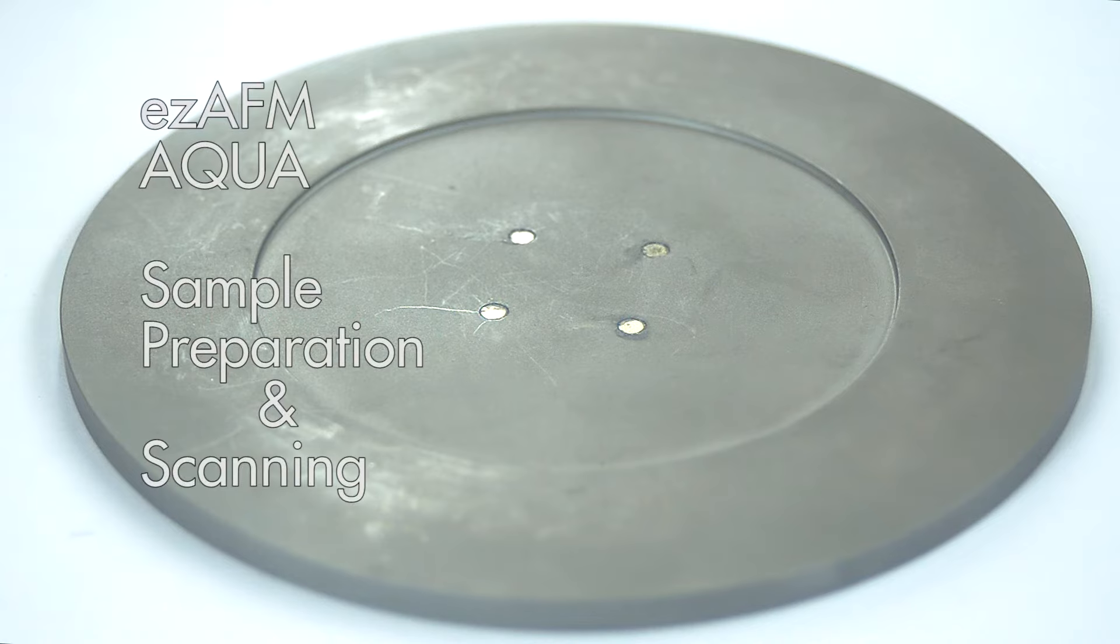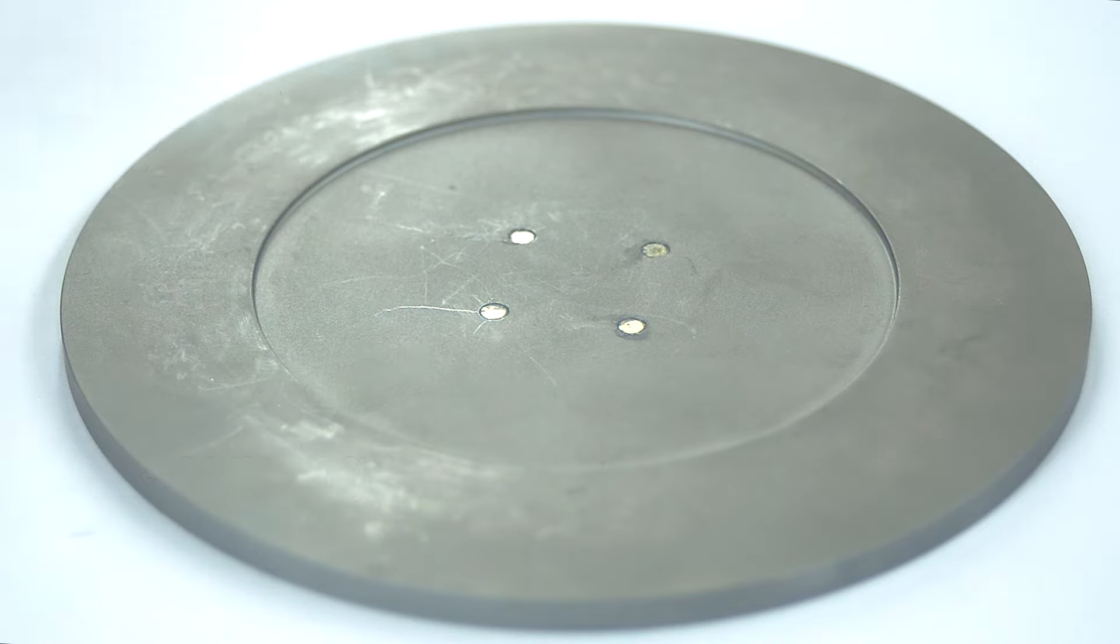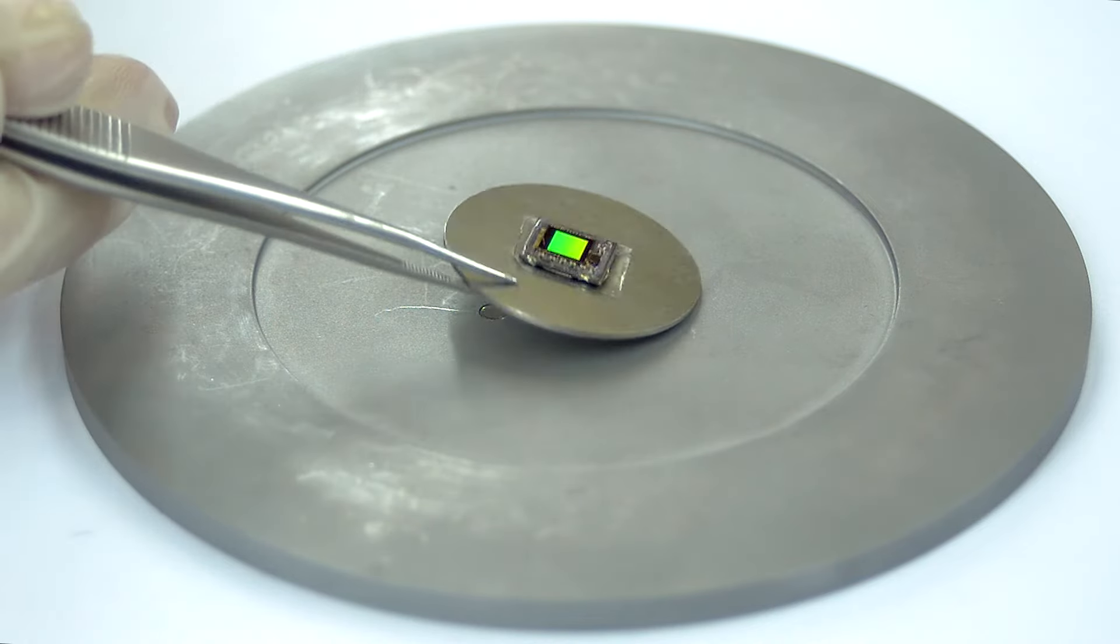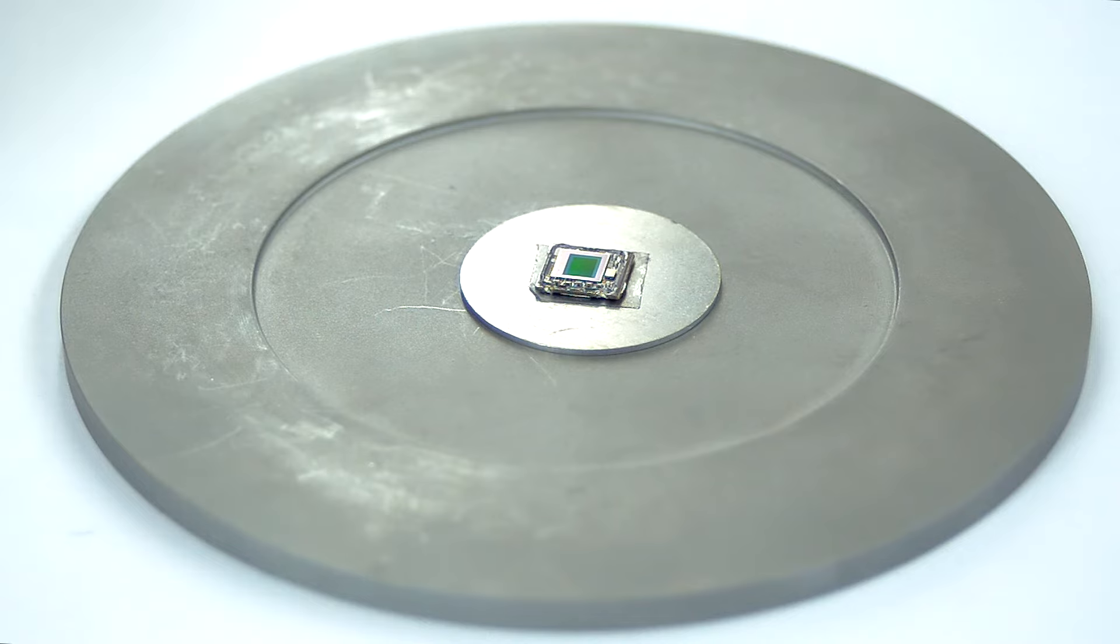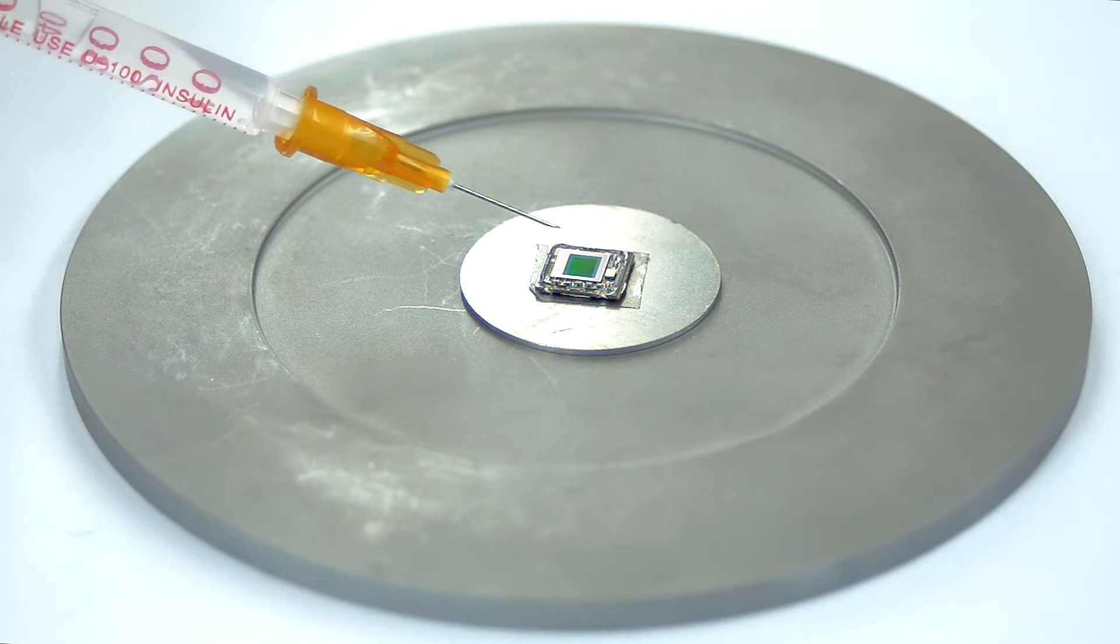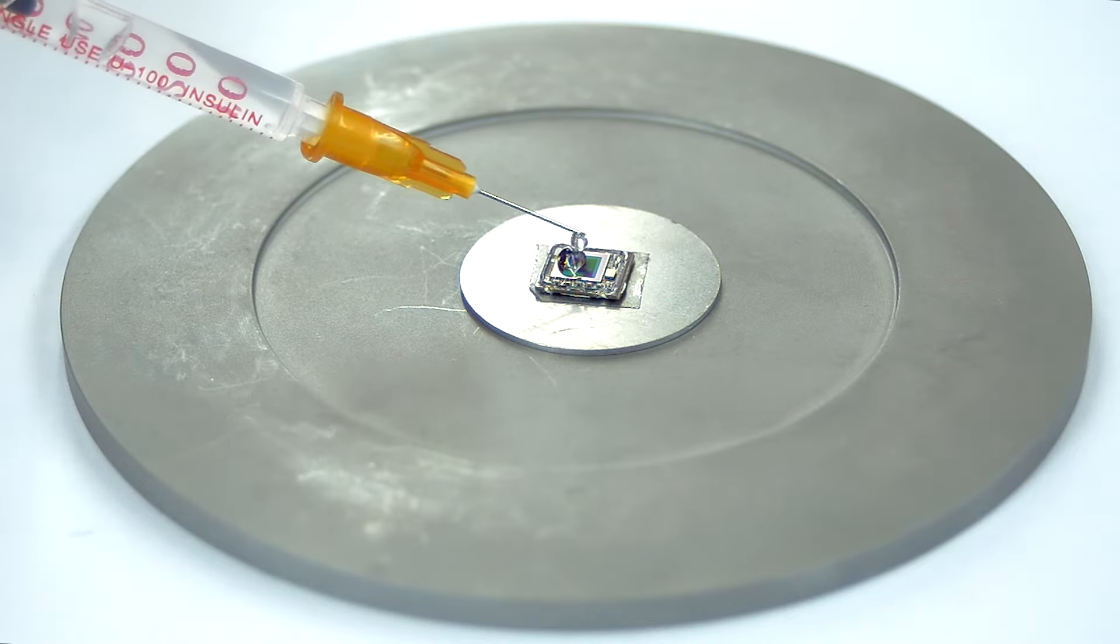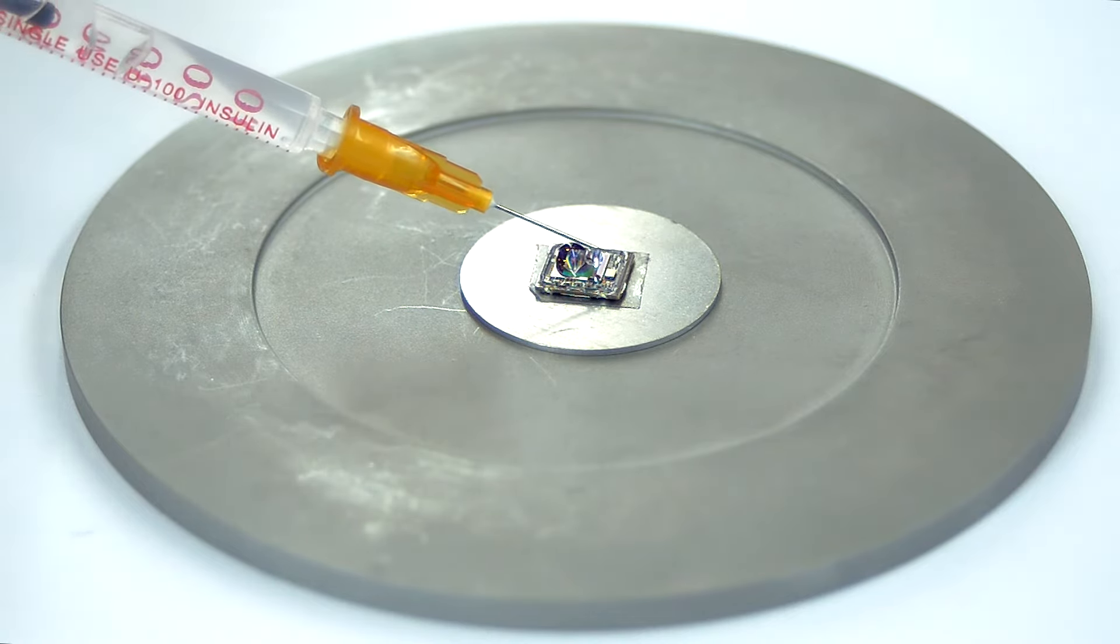Begin by placing your sample holder with the sample on the base plate. Using a syringe, carefully cover your sample with the liquid.